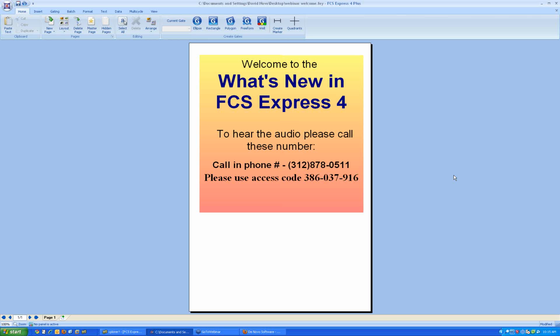In FCS Express version 4, not only have all our algorithms been optimized, but they've also been changed to use as many CPUs as your computer has. So if you have a 4-core CPU, all of the computationally expensive processes like compensation, gating, gathering statistics, plotting, anything that uses a lot of computing power is now being done across all of the cores of your computer and will be much faster. So you can take advantage of all that really good hardware that you have.